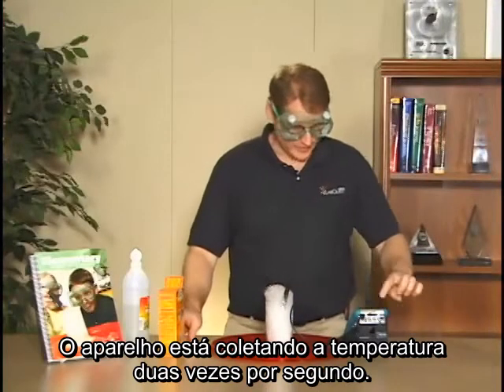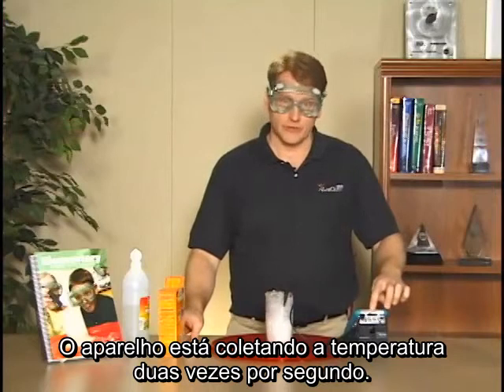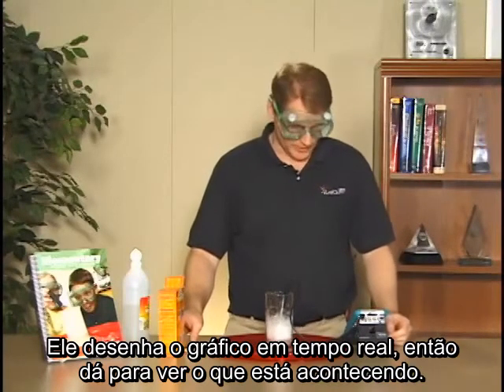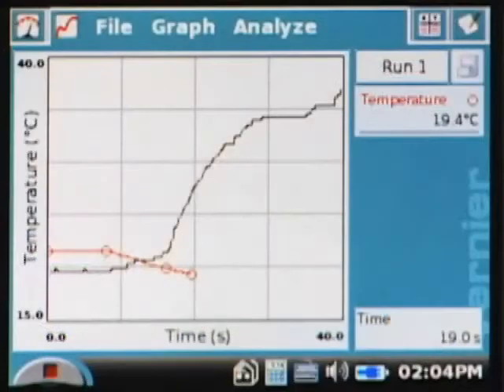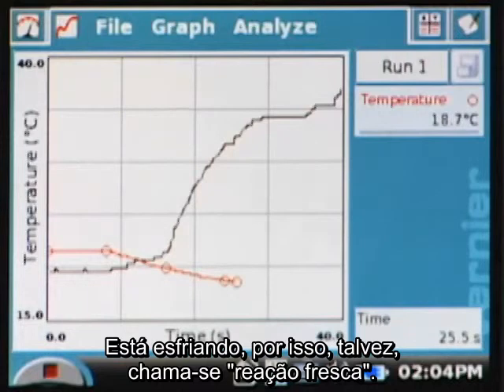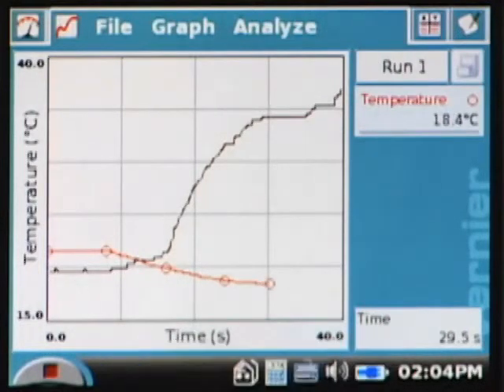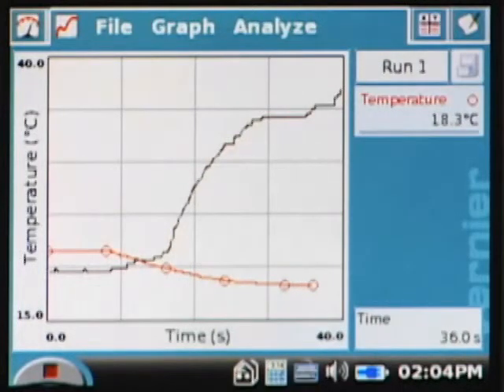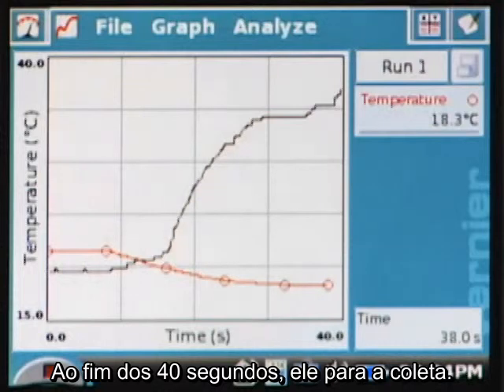The device is collecting the temperature twice a second, and is drawing that graph real time as it's collecting, and so we actually see what happens here. And it did not go up as my prediction said it would do. It actually went down, and so it was cooling off. I guess that's why they named the lab the cool reaction. And so it's almost finished data collection there. And so 40 seconds is up, and it stopped collection there.